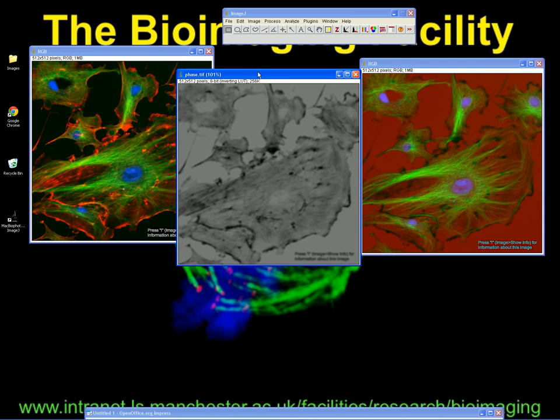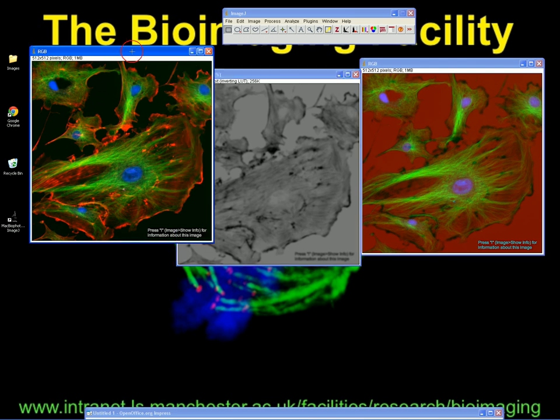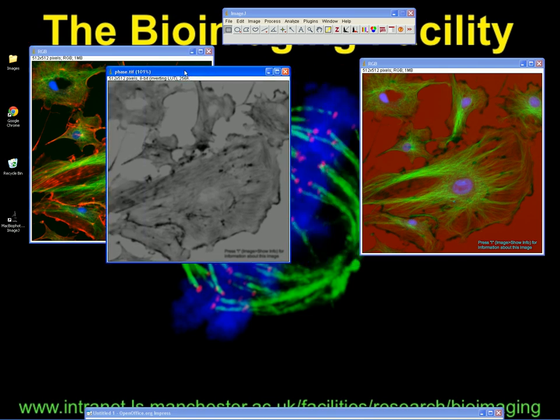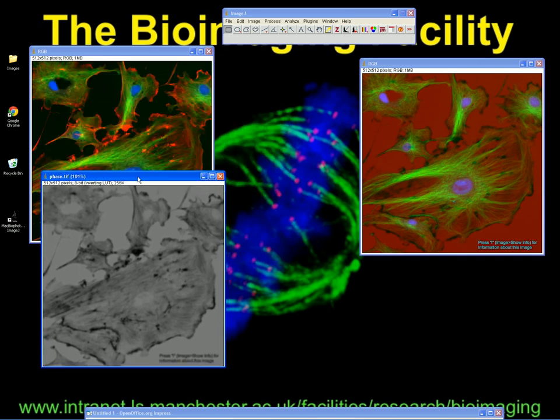It depends really how you capture those images on the MetaMorph or MetaView system. Some people collect two or three fluorescence channels and colour those into an RGB document in the normal way. They then save another image just as a TIFF, which is their phase contrast or bright field image. That's the first way of doing it.